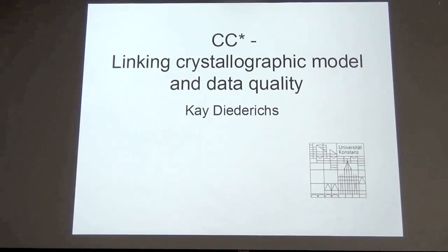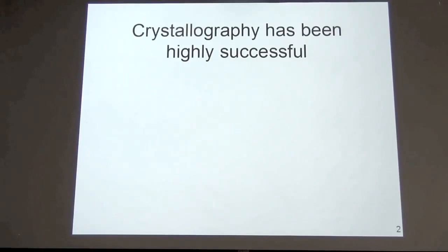Okay, so this talk is about CC star, a quantity that provides a link between crystallographic model and data quality, and I'll broaden this topic a lot more.